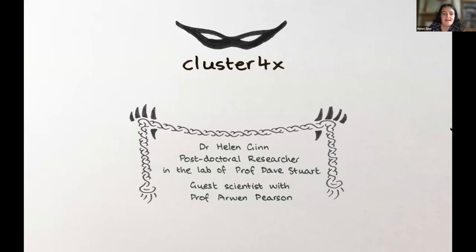So yeah, thank you very much for the introduction, and thank you for inviting me to give a talk. I'm going to give a talk on Cluster4X, which has actually been developed in response to the coronavirus pandemic, and I'll give a little bit of detail about how it works and what you can use it for and how you can get it.